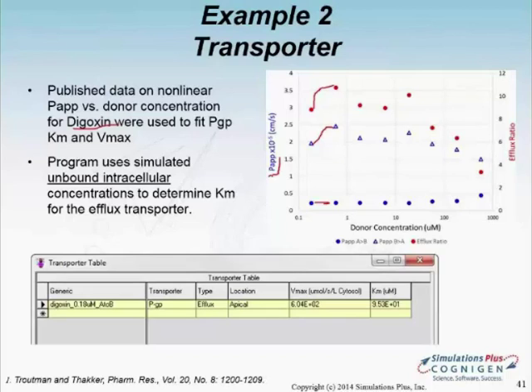Well, you can incorporate both into the system. The lysosomal trapping, for that one, we really did not fit any additional parameters. That was really based on the compound properties. So the lysosomal aspect, or the process of drug actually getting into lysosomes, was turned on also in the second case for the digoxin. I just didn't show that kind of analysis because it wasn't an important aspect. But you can include all of these processes in the model, and the lysosomal trapping, being mainly the aspect of the pH differences, would be accounted for automatically by the drug properties, so you would still fit only the transporter parameters.